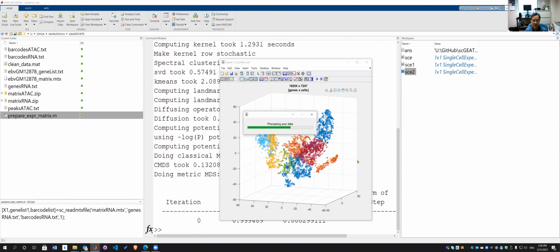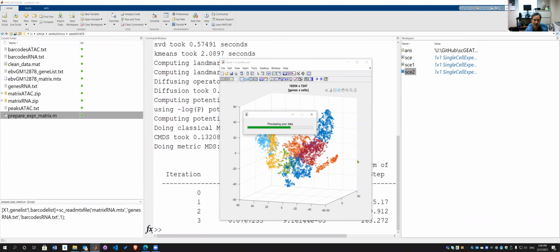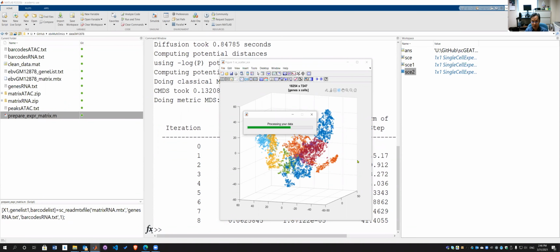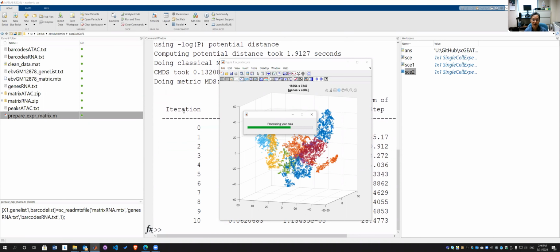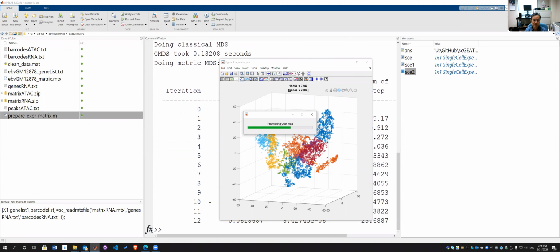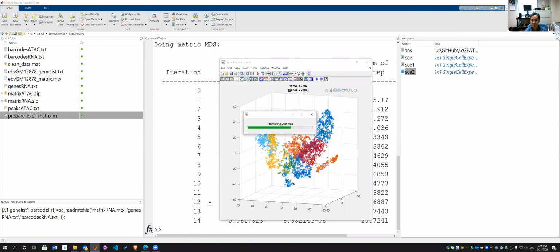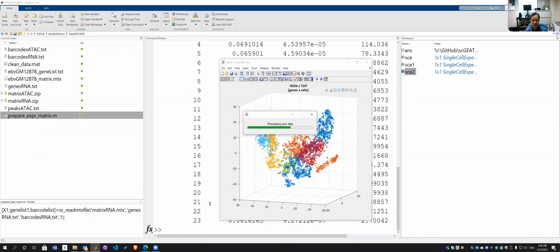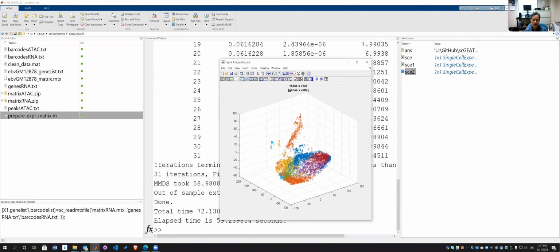You see, I click the button, and in the background, the FIT algorithm starts to run. There are iteration procedures in the algorithm, so you see the progress until it reaches some level of convergence, then it will stop and present the data. So just give it a couple of seconds. This algorithm is fast enough to give results very quickly. All right.